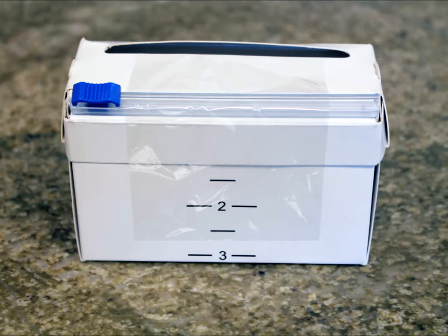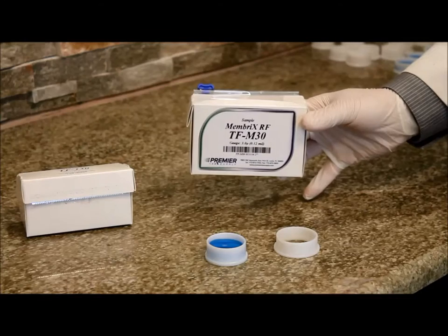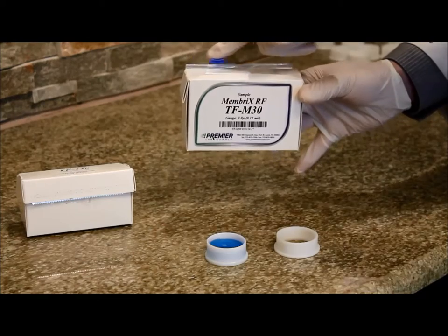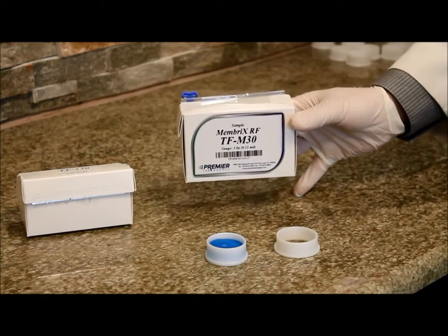Premier's new Skybox film dispenser eliminates serrated edge cuts by incorporating a slide cutter attached to the film box to easily facilitate a sharp, clean, even cut every time.